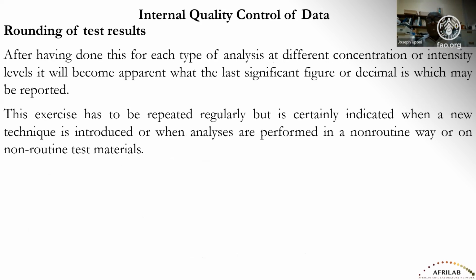In rounding up, I would like to just mention that when it comes to the issues of quality control and quality assurance in soil testing labs, 4 key things are important. Make sure that the samples have been properly collected and that the sample integrity is maintained from the time of collection to the time of analysis and disposal.